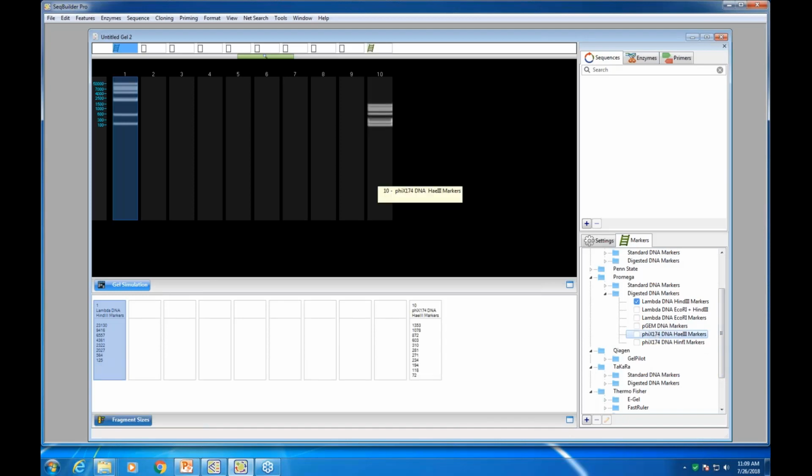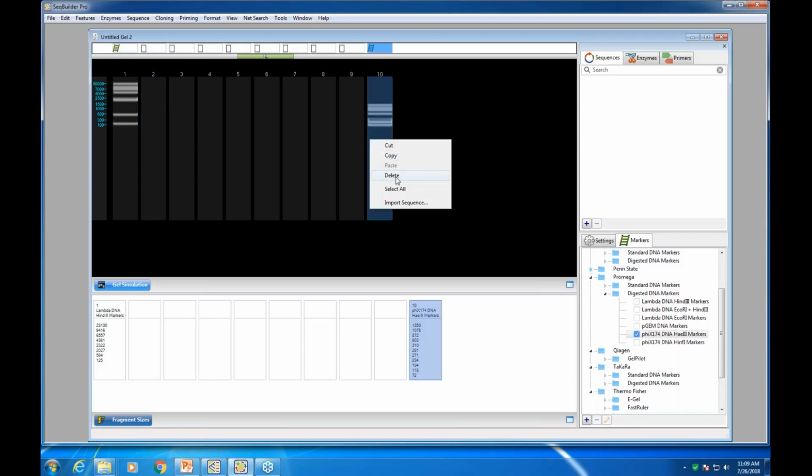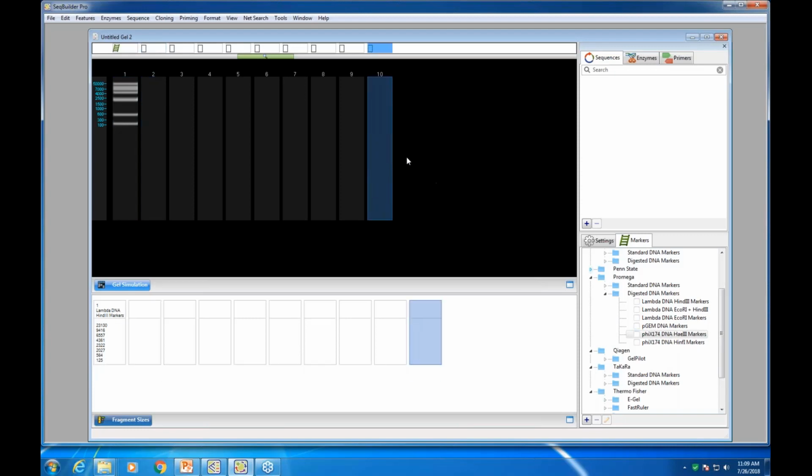So again, depending on what you're comfortable with and how you like to work. When we showed this to the first users, the Mac users tried to drag and drop, and we realized, well, we really need to add drag and drop support throughout this. Whereas the Windows users were more likely to check a checkbox. So there are different ways now. You can see that I can select the lane, I can delete, I just right click, delete if I don't like something that I loaded. So I can copy and paste, so you can edit this as well.